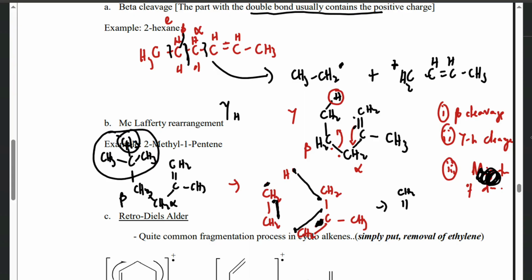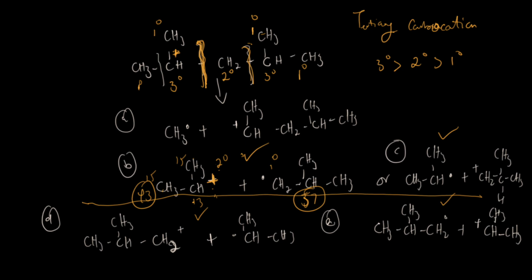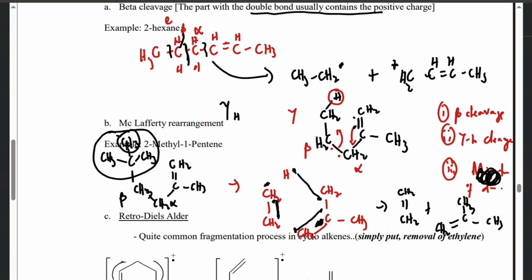So we're going to have CH2 double bond CH2, plus this structure. CH2 is joined to this, so you can call it CH3 already. So we have CH3 and we have this double bond CH2. So don't worry, I'm going to explain better. Let's use a plain board like this. So what we did there was, the example was 2-methyl pentene. So 2-methyl pentene, right? So let's explain it again.